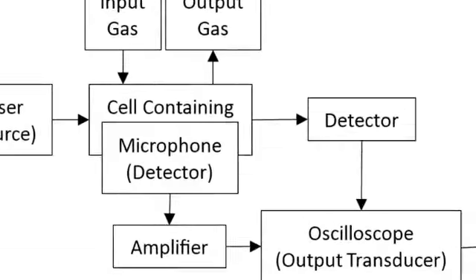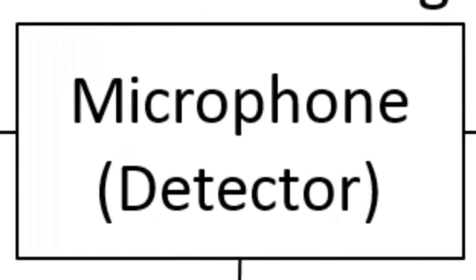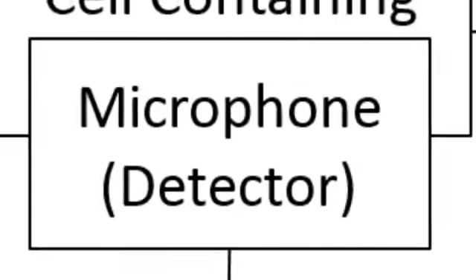As with all instrumental techniques, there are advantages and disadvantages to using PAS over others. An advantage of using PAS is that it has little to no interference signals. Due to the nature of the microphone being inside the cell, which is sealed off from external noise, the microphone is less likely to pick up sound interference. Conversely, an ultraviolet spectrometer could have nicks, smudges, or lint on the cell which would interfere with the absorbance of the sample and detection by the instrument.